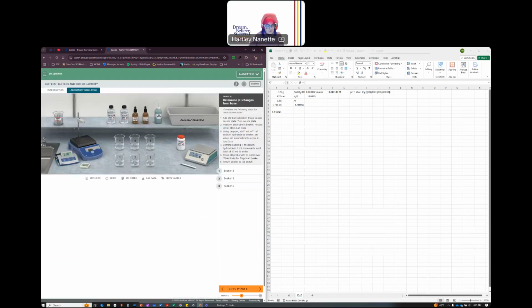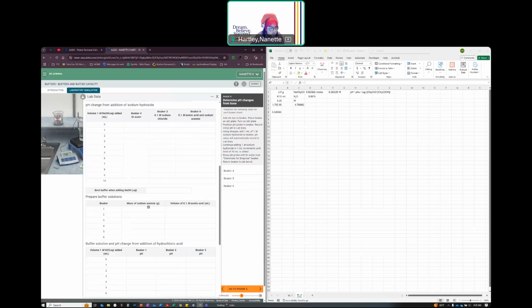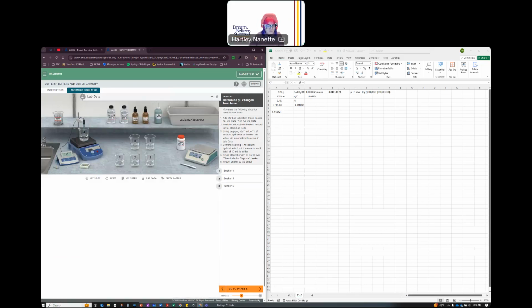Now we're going to do the same thing here. This in here. And we're going to add sodium hydroxide.